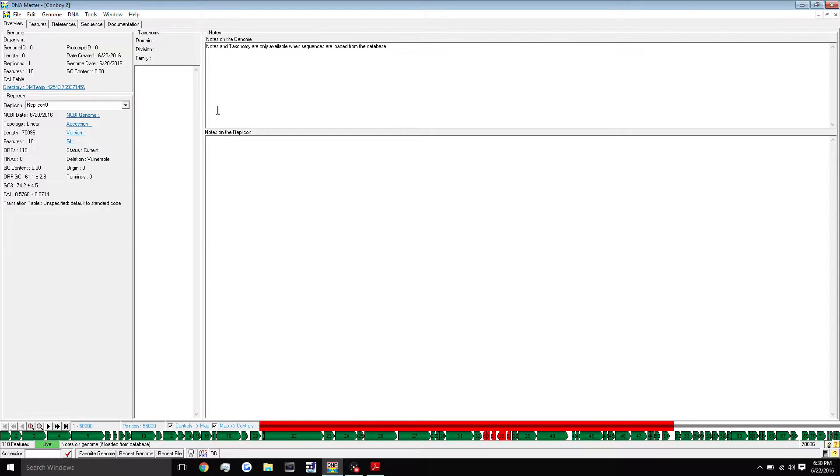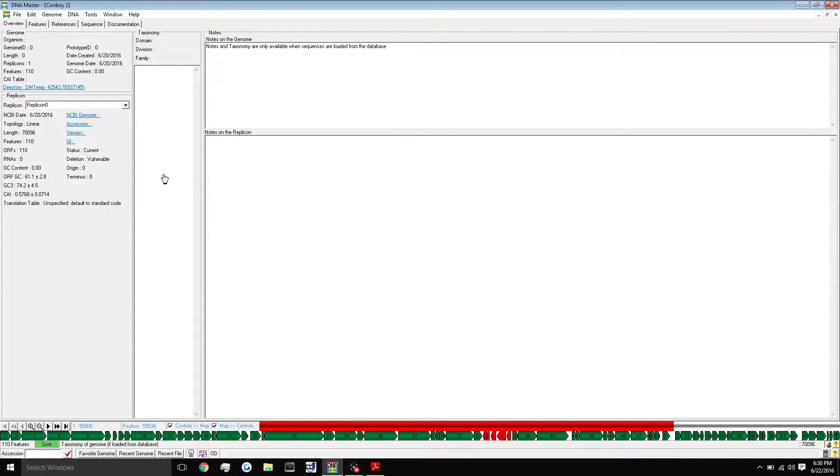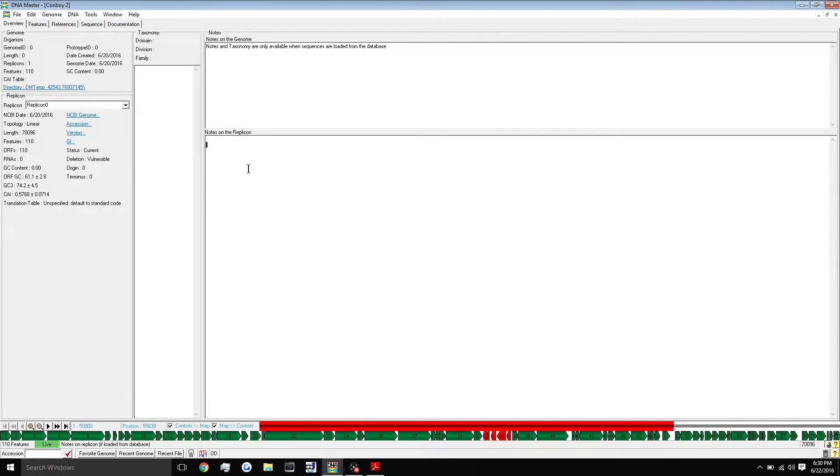If you watched previous tutorials, you know that we skipped over the blast genes option of the auto annotation process. But now we're going to have to do this anyway. I warned you guys that we would have to do it eventually, and this is the time for that.